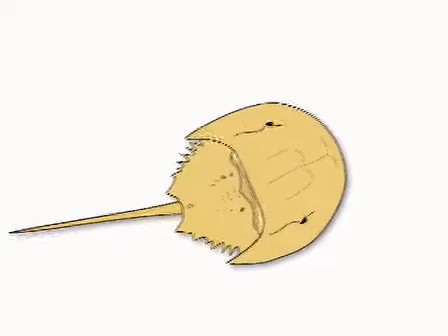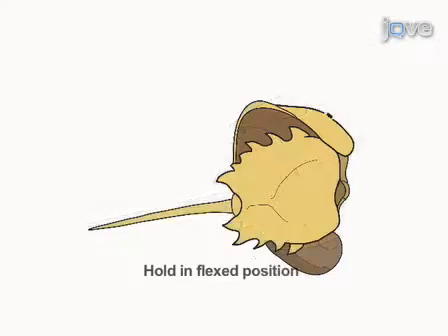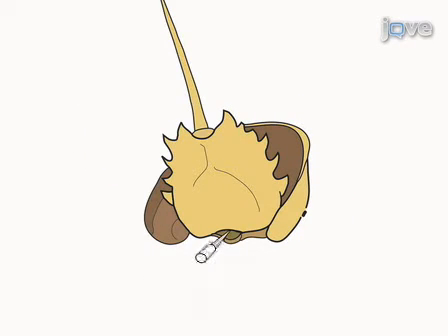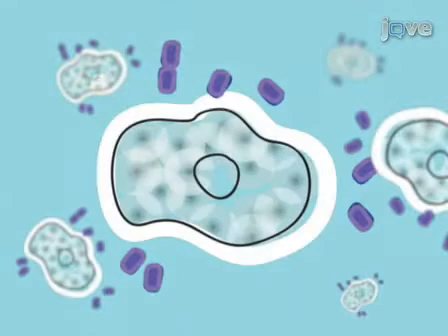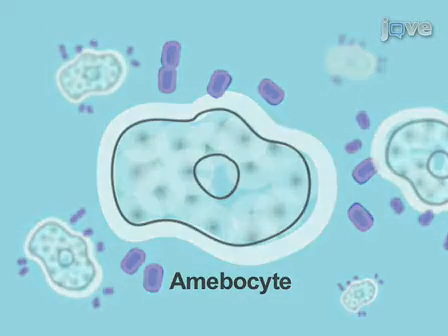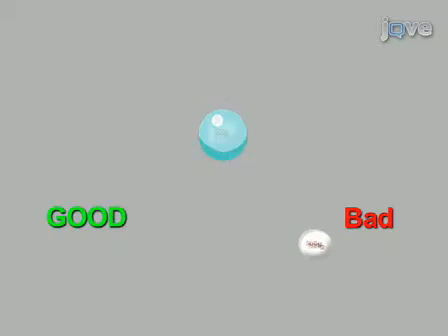In order to bleed the American Horseshoe Crab, Limulus polyphemus, one must hold the crab in a flexed position and insert a syringe needle into the hinge to puncture its heart. Once its circulatory system is accessed, an adult crab can be drained of nearly all of its blood. Its blood contains a highly motile cell type called an amoebocyte that secretes specialized clotting factors which react violently in the presence of gram-negative bacteria, a fact which has led to the adoption of the Limulus amoebocyte lysate assay, or LAL gram-negative test, by the FDA.